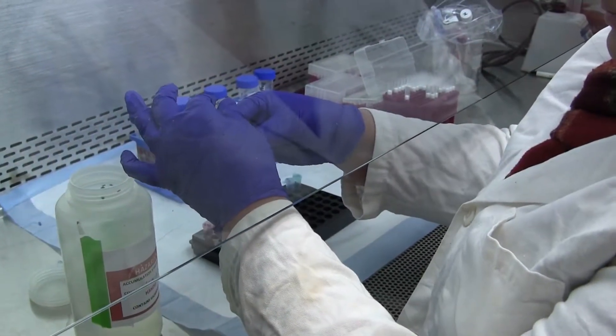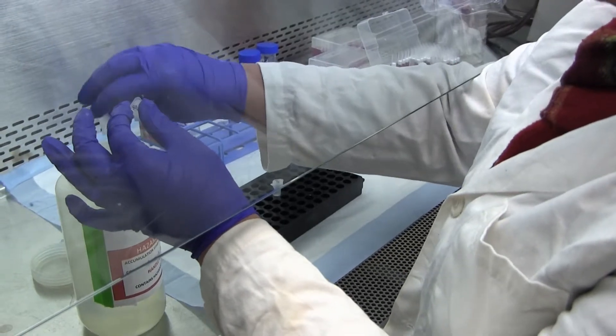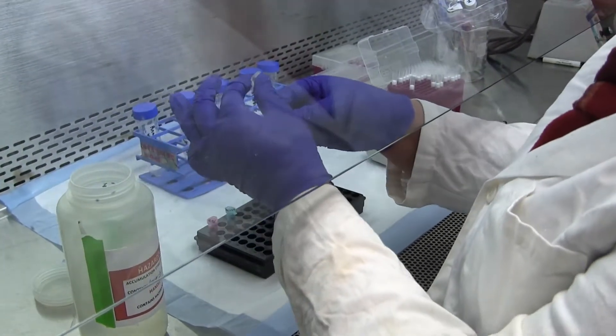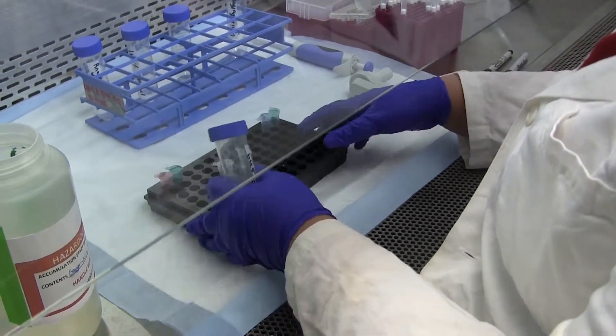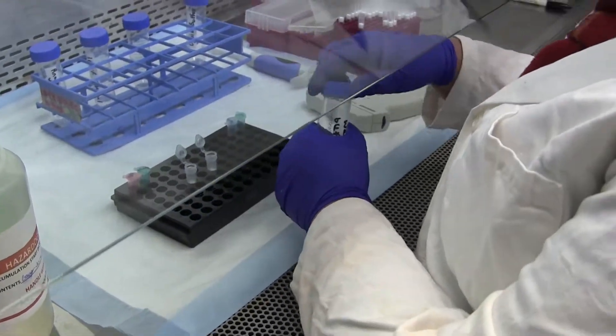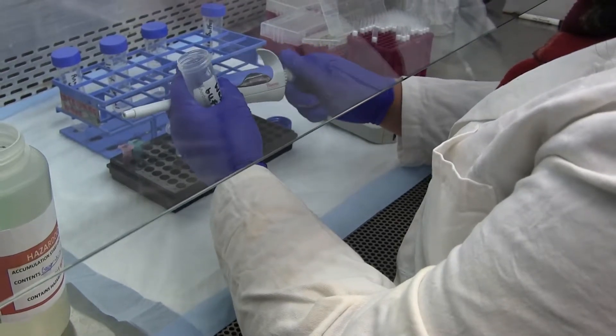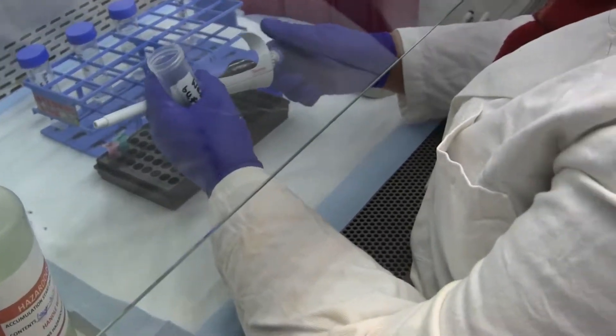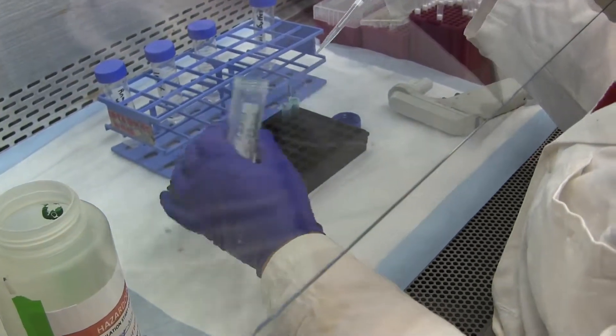So then after dumping the flow through, another wash, the second wash buffer, 400 microliters. In the Qiagen kit here, we have two different wash buffers, and the CDC protocol is just the same wash buffer. But both of them have a smaller percentage, around 70% ethanol, and that's required for a wash buffer. So next step is to centrifuge.